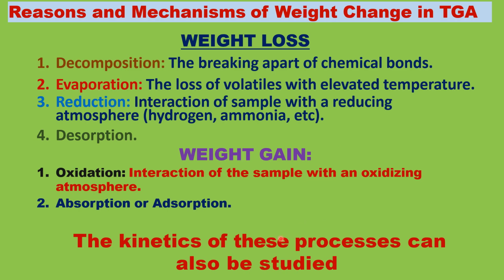In all these thermochemical reactions, the kinetics, the rate of the thermochemical process, can also be studied by using thermogravimetry, by the TGA technique.